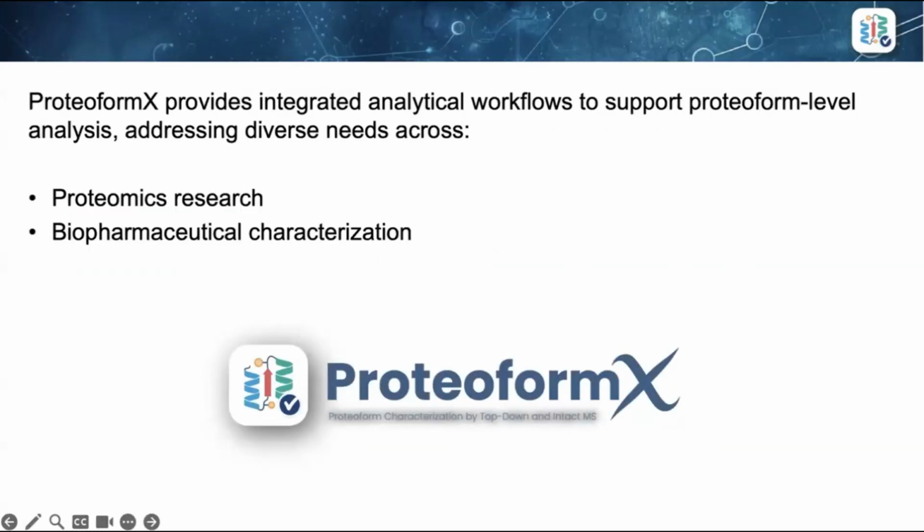So ProteoformX bridges proteoform analysis across both research and biopharmaceutical applications. It integrates workflows for fundamental proteomics research and biopharmaceutical product characterization. By integrating multiple mass spectrometry strategies, it solves complex challenges across research and development.